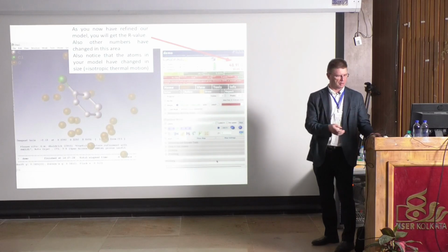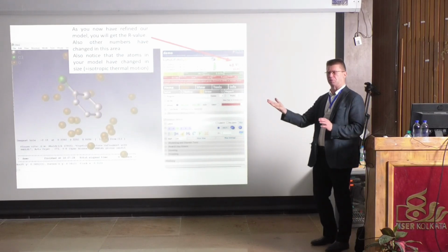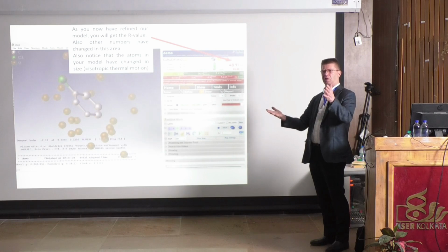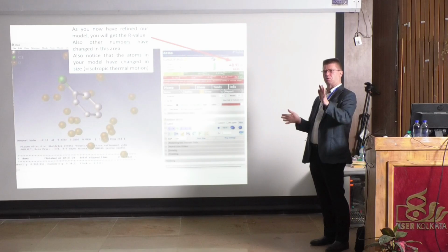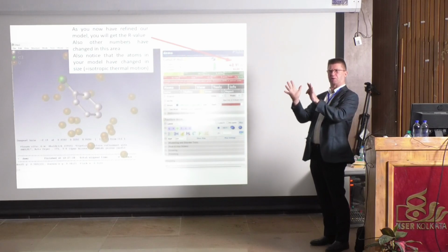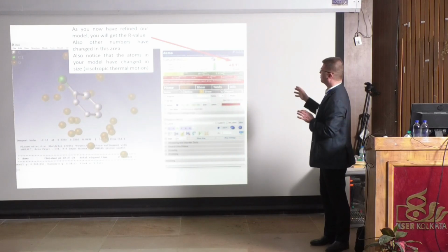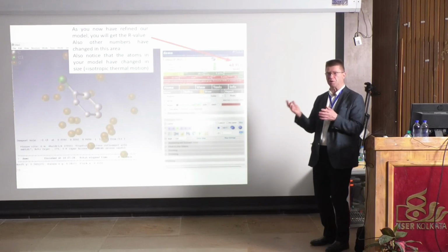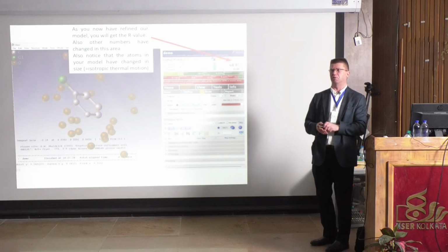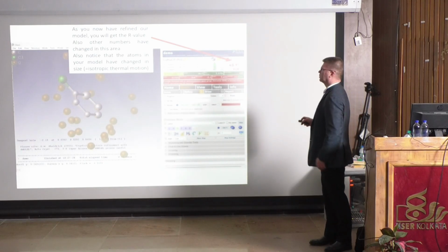This is interesting in that sense: we have data that contains all the information, and then we have a model. Now we have a partial model, so we don't see everything here, but in this model we have only maybe 3 out of 5. So something is missing, and this is indicated by this number. So now around half of the structure is correct. As we know, there should be more atoms there when we have to locate all the atoms. So that's the idea.